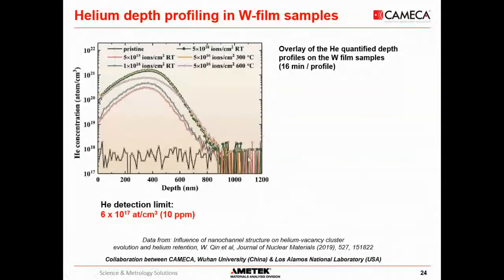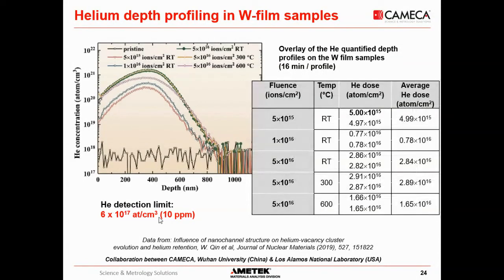And we could achieve a detection limit of about 6x10^17 atoms per centimeter cube, which means about 10 ppm, which is very good for helium, which is a noble gas. There have been 2 runs performed on each sample that show a very good reproducibility between the 2 runs.